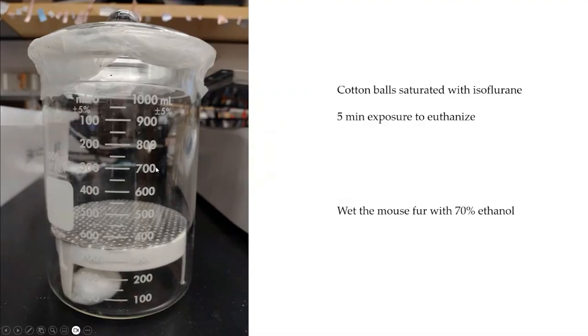It'll be struggling for a few minutes, and eventually it will become immobile, and after 5 minutes you will have a mouse that is recently euthanized.